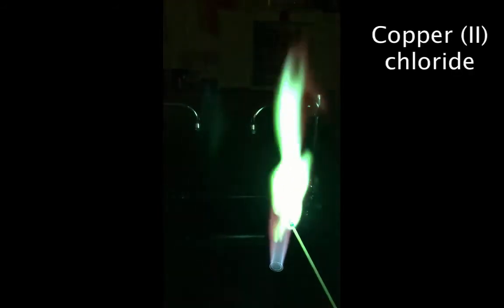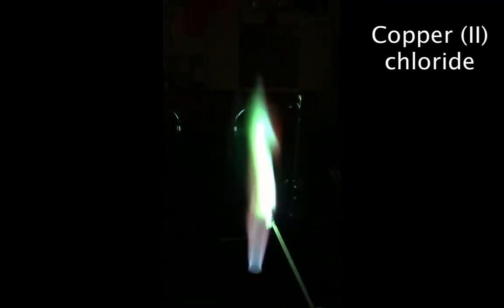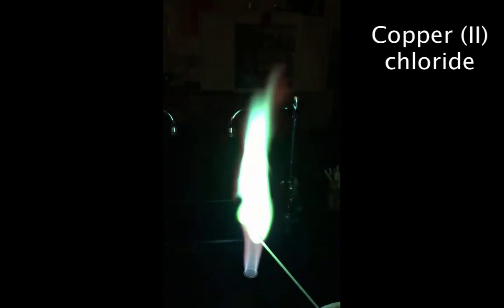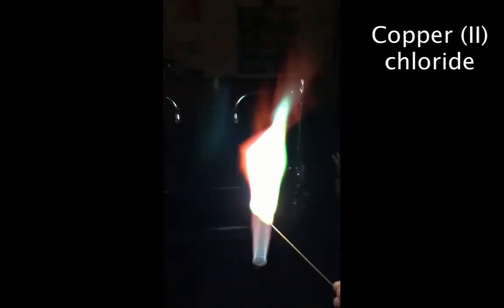The very last metal we're going to burn is copper. I'm going to dip the wooden splint into the copper chloride and hold it in the flame. We get this nice blue green color — immediately close to the copper is blue, and then the outside of the flame is a nice green color. Those were all six of the metal chlorides.